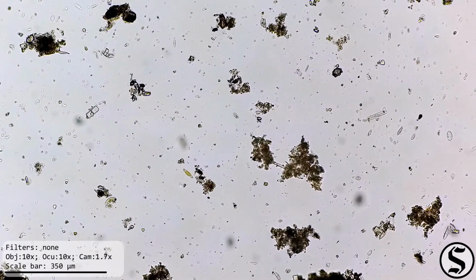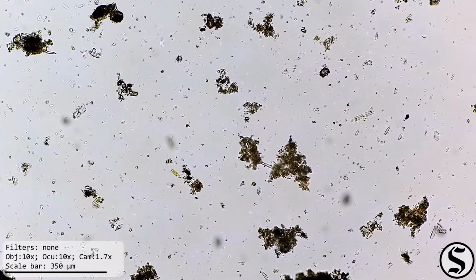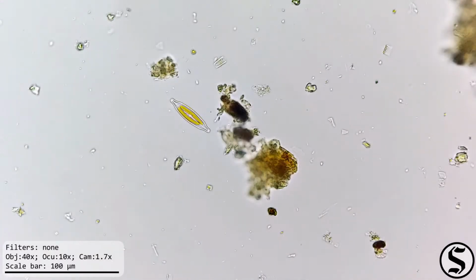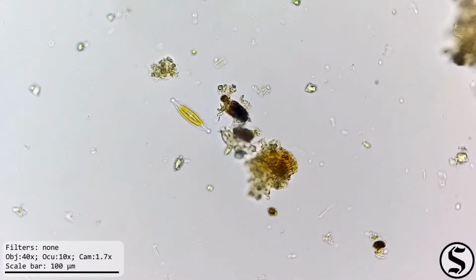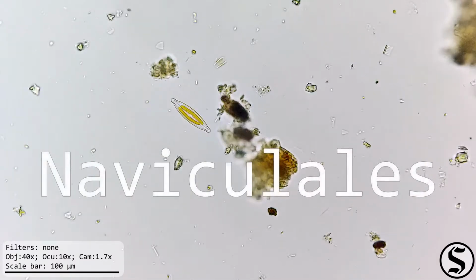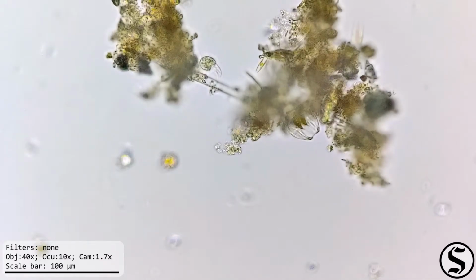When I zoomed back out, I saw some movement here. This is definitely a ciliate. I happened to be looking at this diatom when I zoomed in, so I figured I'd have a peek at it. Looks like naviculales. And this ciliate's a bit of a funky angle to us.